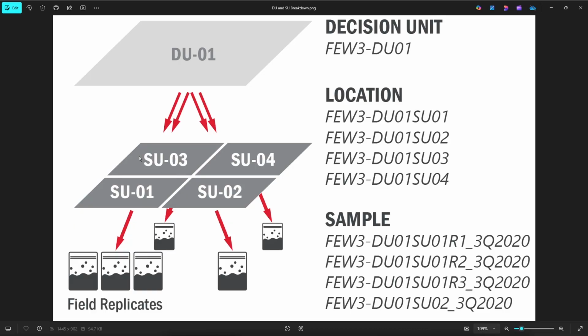Once the incremental sample and replicate field samples are received by the laboratory, the samples will undergo project-specific sample processing and subsampling. A subsample is a small portion of material selected from the field sample by the laboratory for analysis. 3 or more subsamples may be taken from a single field sample as subsample replicates. The subsampling replicate represents the laboratory replicate in FUDSChem. For ISM application, the field samples and laboratory subsamples should never be referred to as a duplicate or triplicate, but as replicates. Replicate samples are independently collected incremental samples.